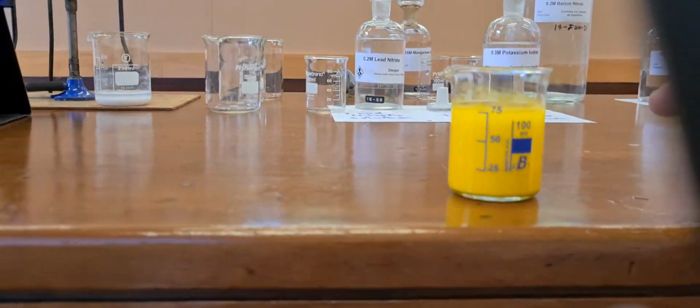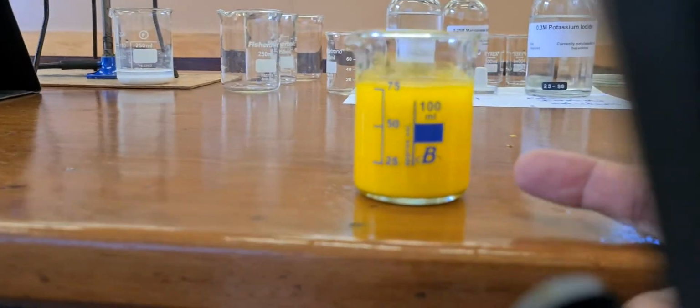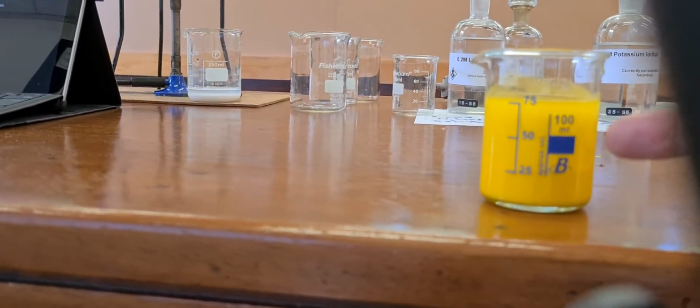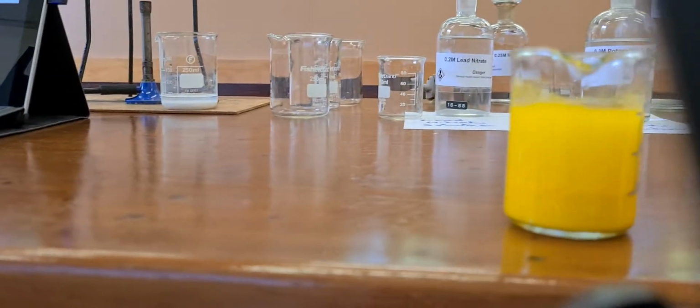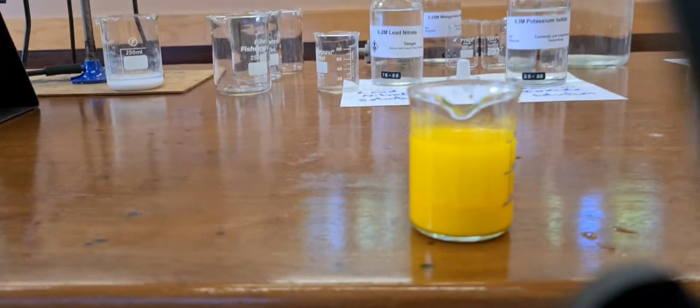Remember that yellow solid? Can you see there's some, where my finger is at the bottom, you can see the solid is settling, the solution above is clearing. Maybe if I turn it around you can see it a bit better. There you can see the solid at the bottom and the solution above is clearing.